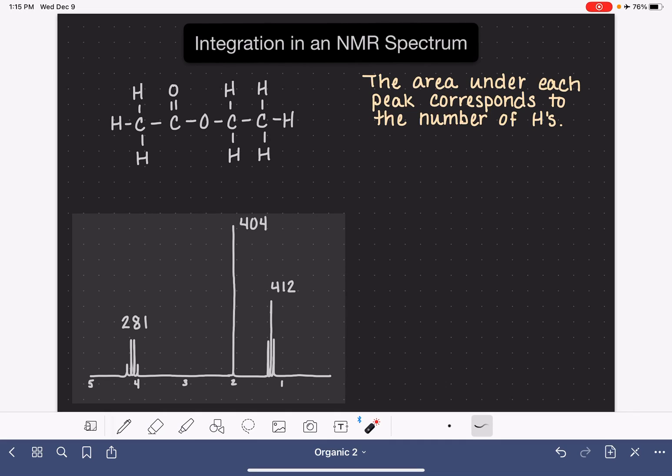In proton NMR, the area under each peak corresponds to the number of hydrogen atoms that are associated with that peak. This is referred to as integration, and in this video I'm going to teach you how to analyze the integrals of an NMR spectrum.